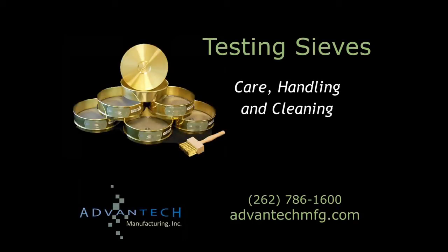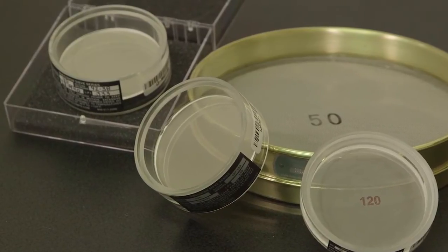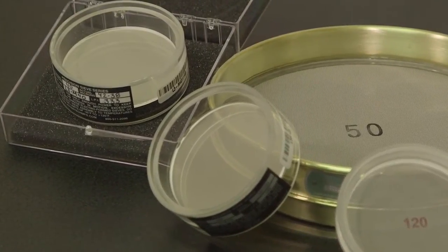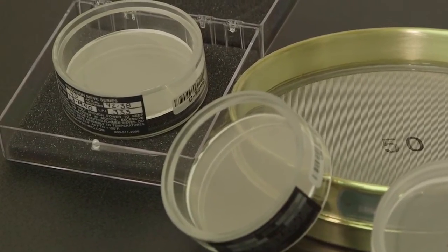The cleanliness of your sieves is important to the accuracy of your lab's test results, as well as to avoid cross-contamination of samples. These delicate, precision instruments require special handling to ensure a reasonable life of service. The manner of cleaning and handling varies with each style of testing sieve.